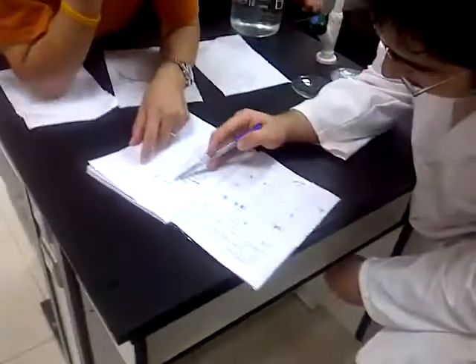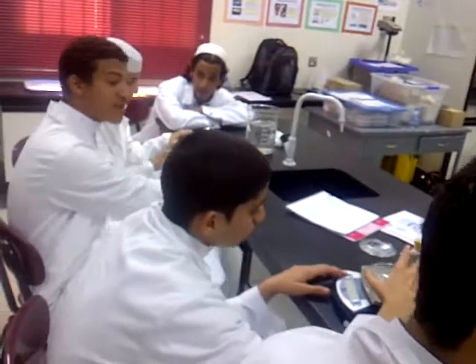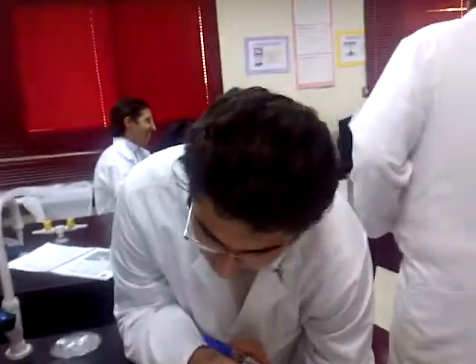The polymer was 0.6 grams. Because this is the glass weight. When you start with the 38.5. And how much of this? This is 1.4 grams of water that you absorb. Okay, so the glass weight. This is the starting weight. Starting weight.